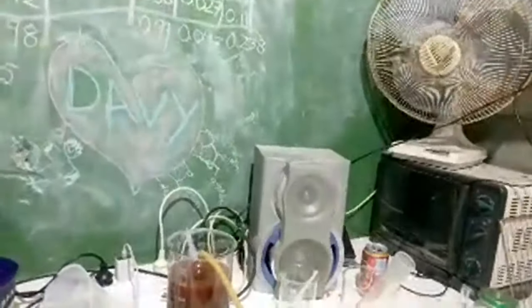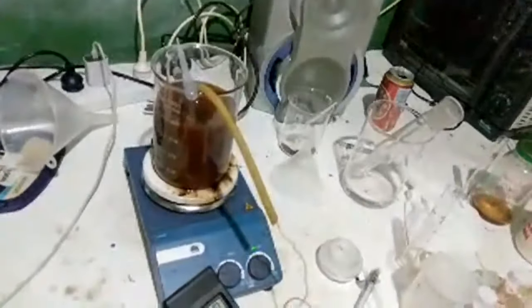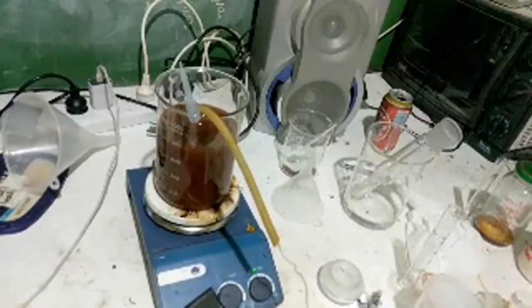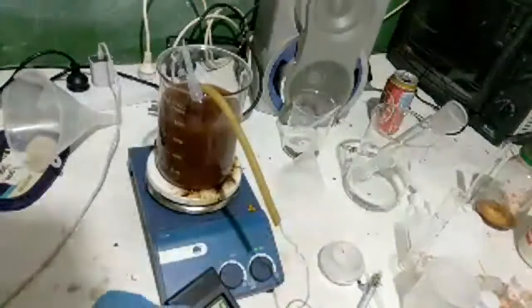Is the reaction exothermic? I think technically yes, but I think it's also very slow when using iron oxide. So yeah, I'll get the temperature up.